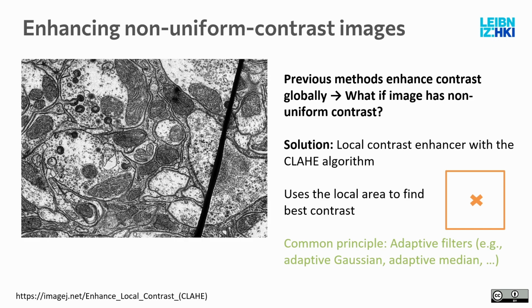So there's a similar method, AHE here without the CL, and this one has this problem. But CLAHE works fine, and you see here in this image it's now uniformly contrast. The annoying artifact here is the same, and the following analysis will now be easier.